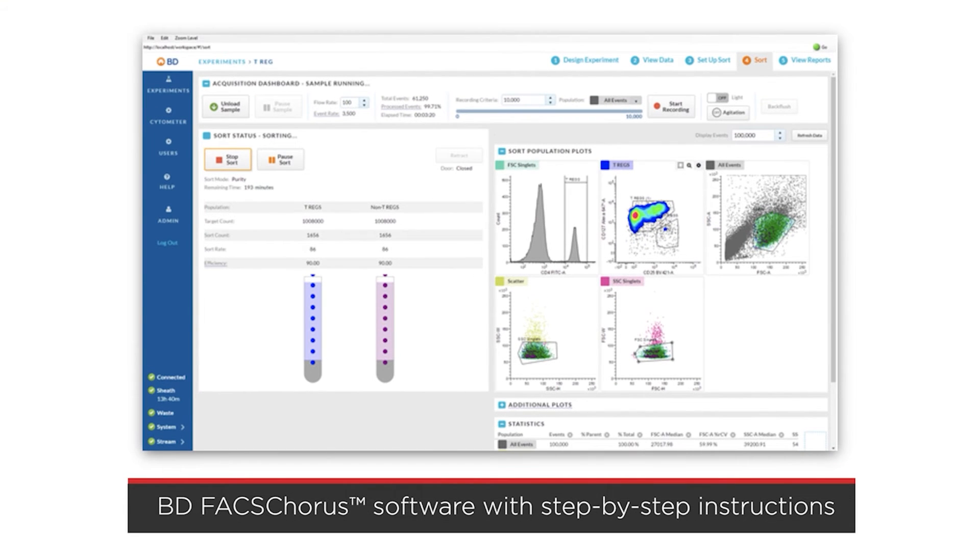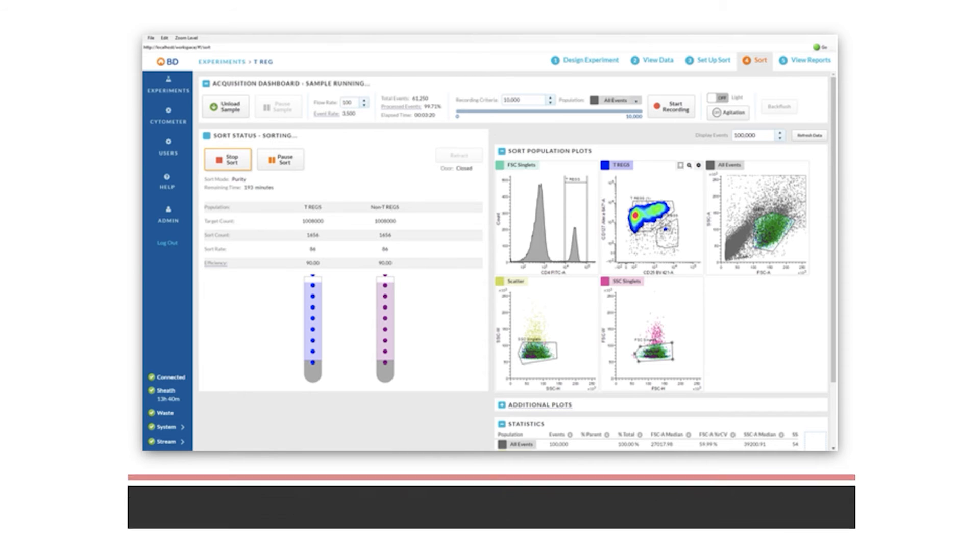The BDFAX Melody system comes with BDFAX Chorus software, which prompts novice users with step-by-step instructions, so it's easy for anyone in your lab to do cell sorting regardless of experience.